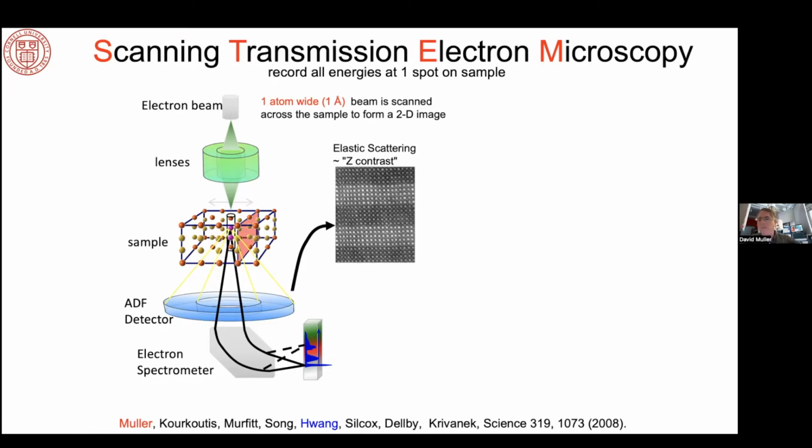Certainly when we're involved in designing high brightness sources, both for microscopes and for synchrotrons and colliders, the cold field emission guns are the highest brightness source we know of. They don't deliver enough current to be useful as a source for a ring, but they do produce a very high brightness source with the electrons they generate, and they generate plenty of electrons for a microscope.